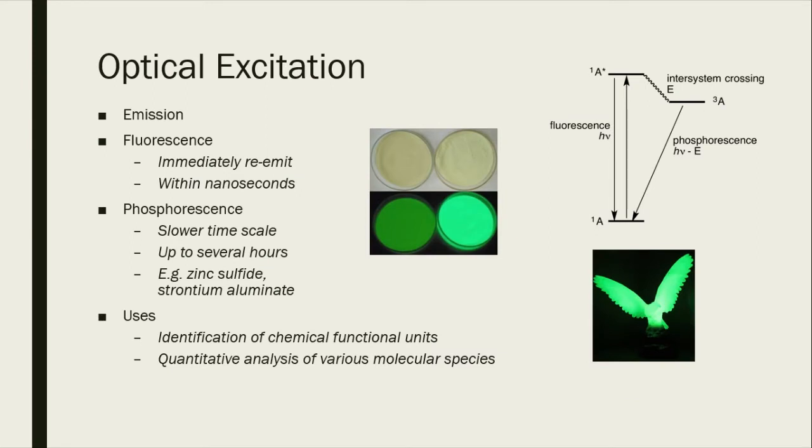So emissions. Now we are talking about fluorescence. A lot of the RT-PCR, using real-time monitoring, if there is DNA amplification, the monitoring idea is to look at a fluorescence label. Now I won't go into the details of why more DNA amplification gives more fluorescent signal. That's too much detail. I don't want to bombard you or burden you with those fine details.